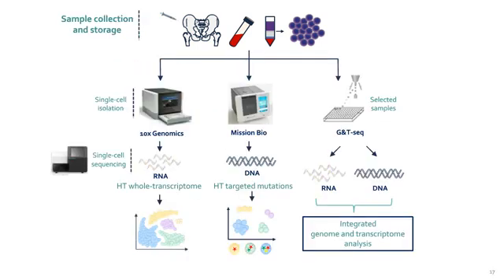And then we prioritize for the single-cell sequencing T-ALL cases, which is an aggressive subgroup of ALL, but also B-ALL cases that had a high white blood cell count at diagnosis or that were MRD positive at day 35. Then from each vial, and in parallel, we process a few thousand cells with the 10x Genomics platform for whole transcriptome RNA sequencing, and a few thousand cells with the Tapestri platform from Mission Bio for targeted single-cell DNA sequencing.